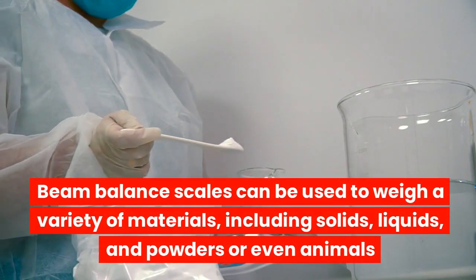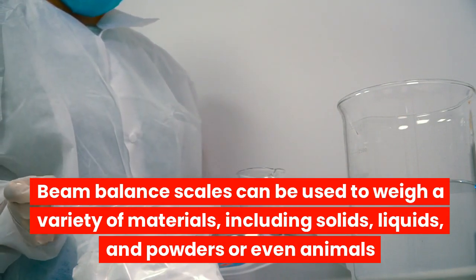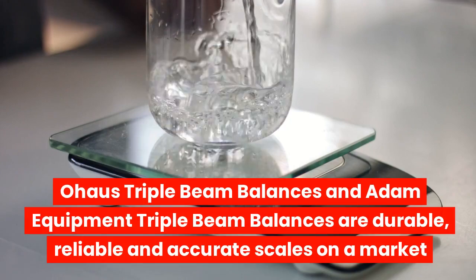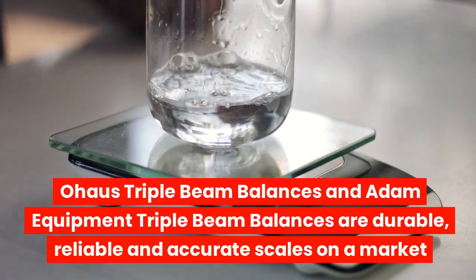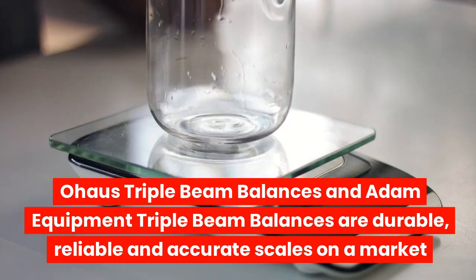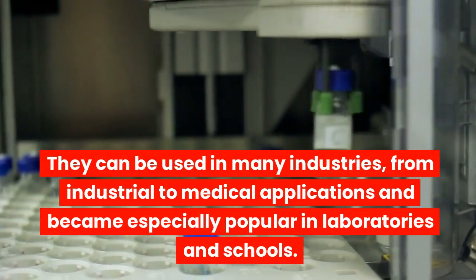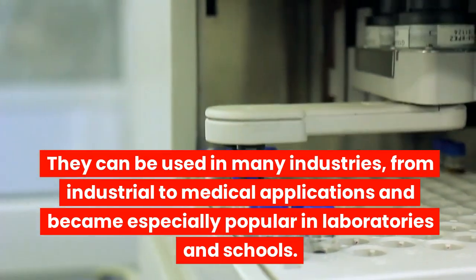Beam balance scales can be used to weigh a variety of materials, including solids, liquids, and powders, or even animals. Ohaus triple beam balances and Adam Equipment triple beam balances are durable, reliable, and accurate scales on the market. They can be used in many industries, from industrial to medical applications, and became especially popular in laboratories and schools.